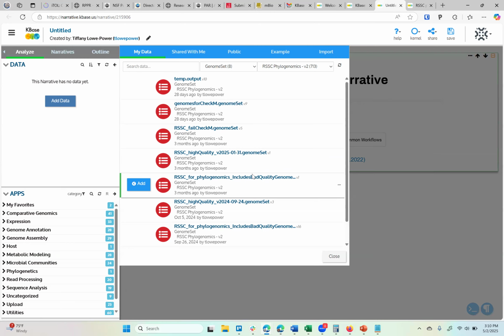You need to follow some more rigorous pipelines that you can run on the command line. So I don't have advice for that, other than what KBase can give us is pretty good resolution, but not perfect resolution for closely related strains.